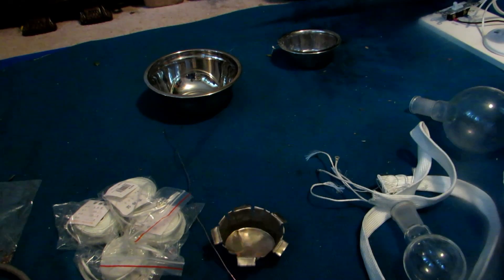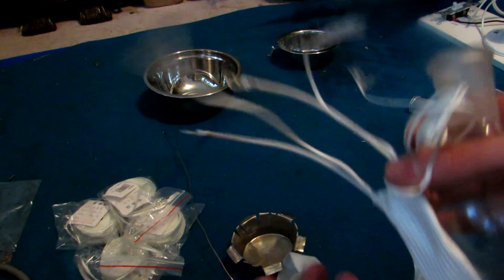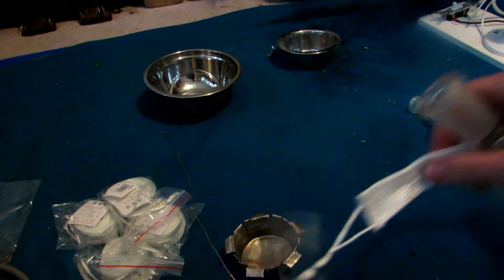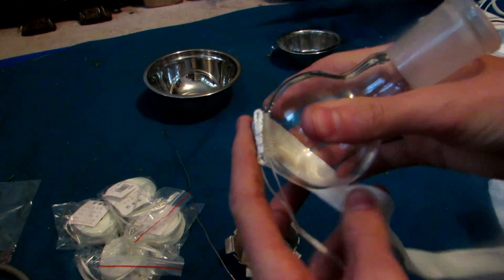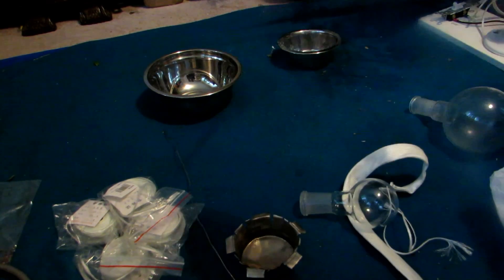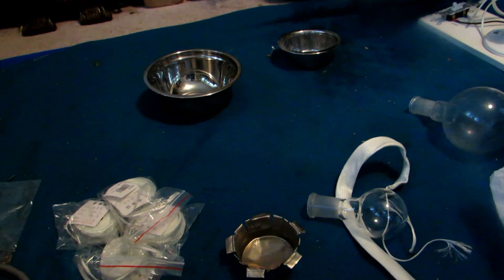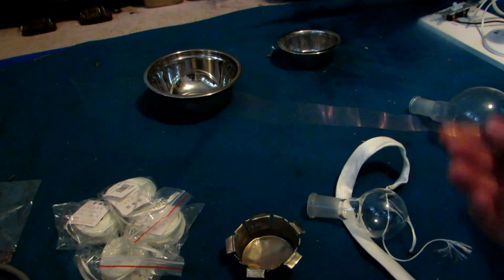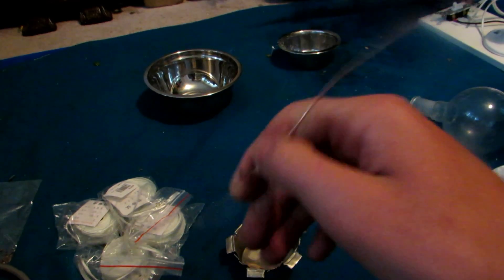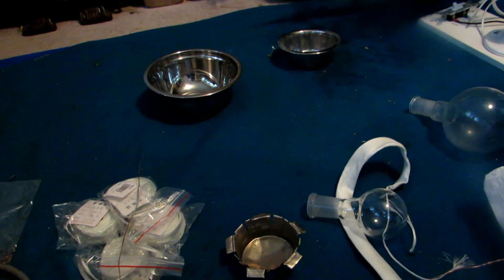Once we have a container that will fit around the round bottom flask fairly well, we're going to take our heating tape. You'll see there are two ends which connect to the power, so we're going to take the opposite end which doesn't connect to the power and start to shape it around a round bottom flask in a coil-like motion, continuing around trying to get it nice and snug so it will fit inside and so we can still pull the round bottom flask out. We're going to use some copper wire to hold it together, wrapping that in and out to hold our heating tape so that it doesn't come undone.